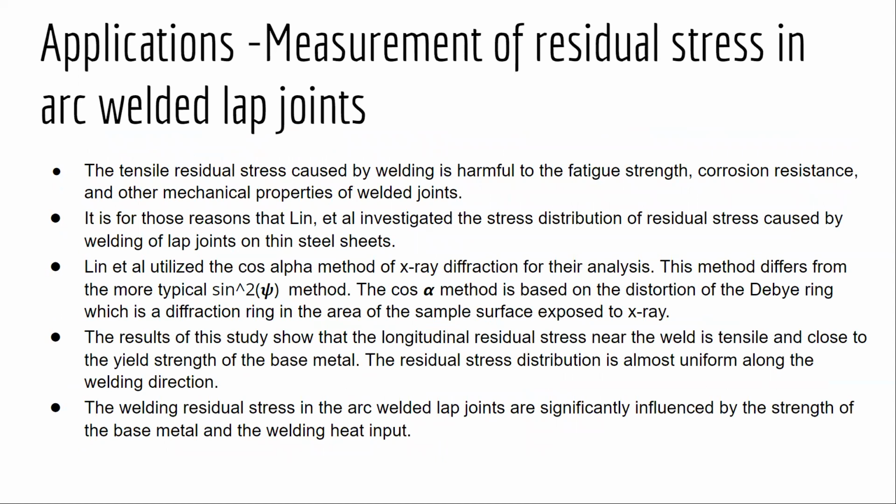Okay, so here are some applications of measurement of residual stress in arc welded lap joints. The tensile residual stress caused by welding is harmful for fatigue strength, corrosion resistance, and other mechanical properties of welded joints. So it's for those reasons that Lin et al. investigated the stress distribution of residual stress caused by welding of lap joints on thin steel sheets.